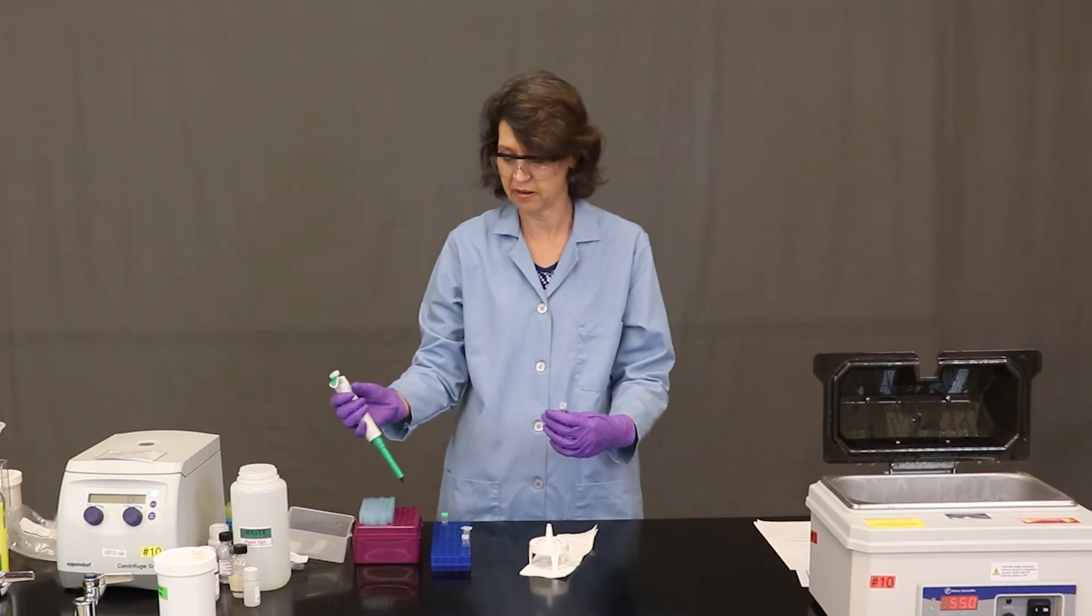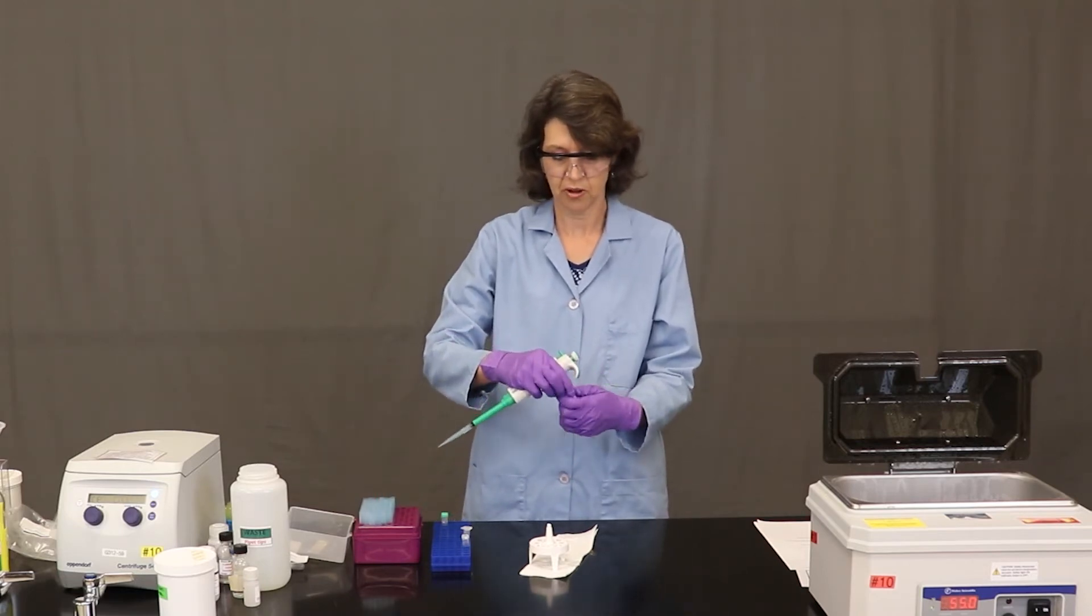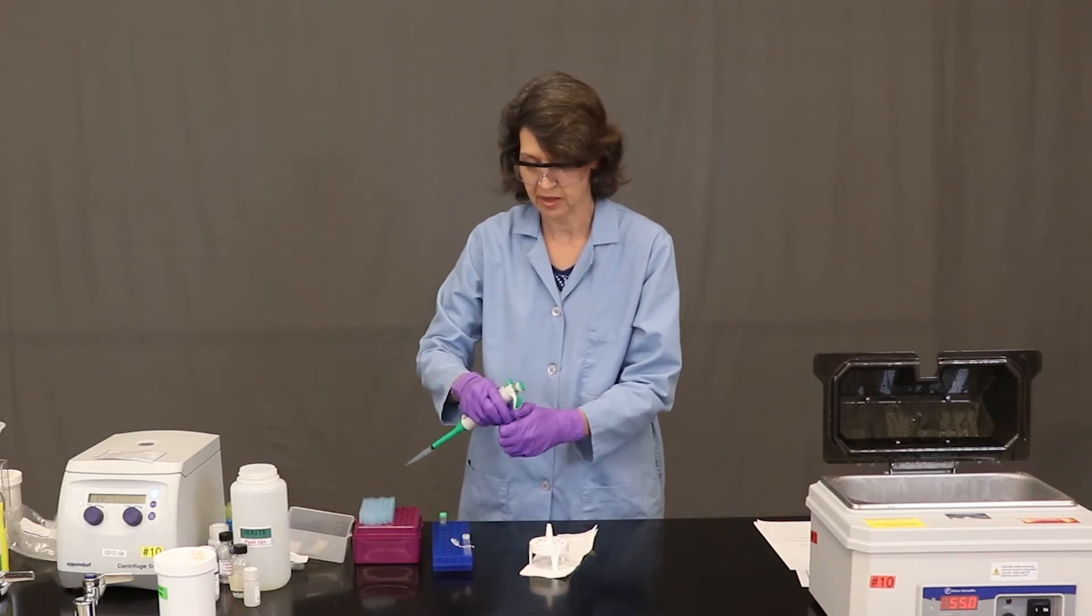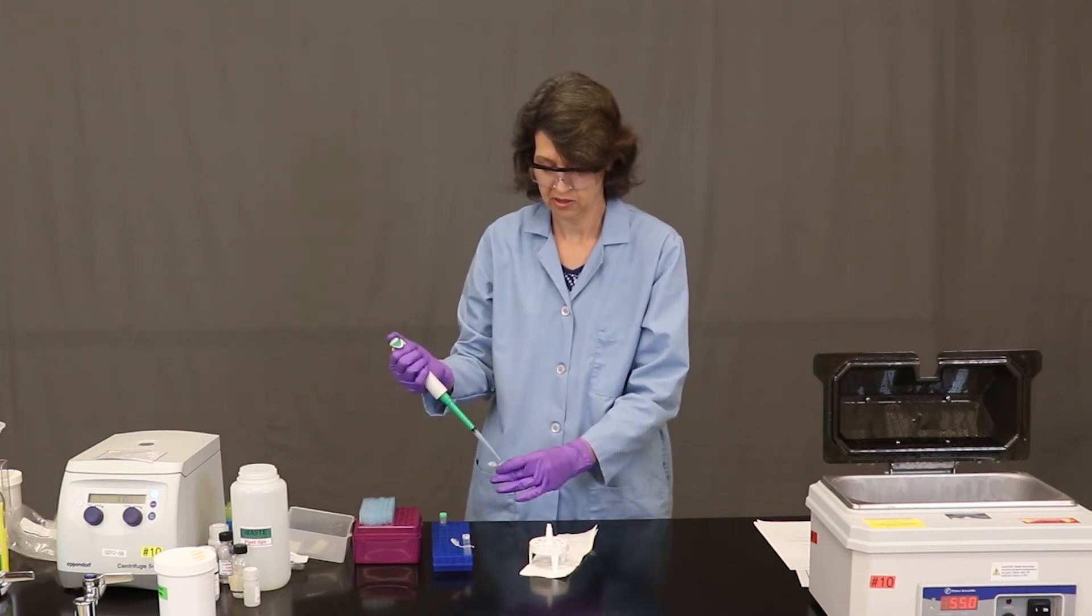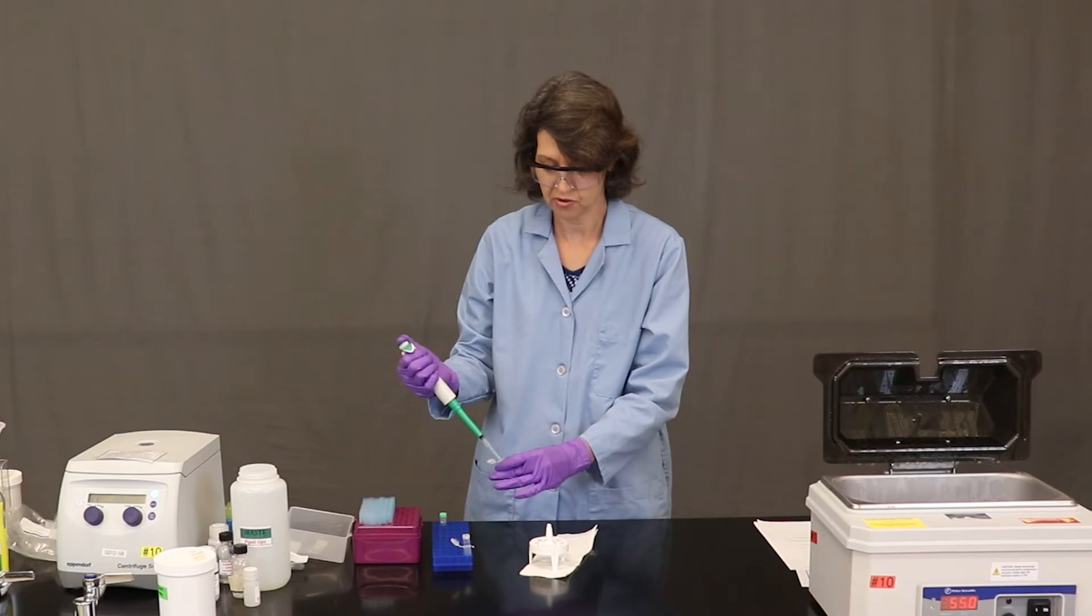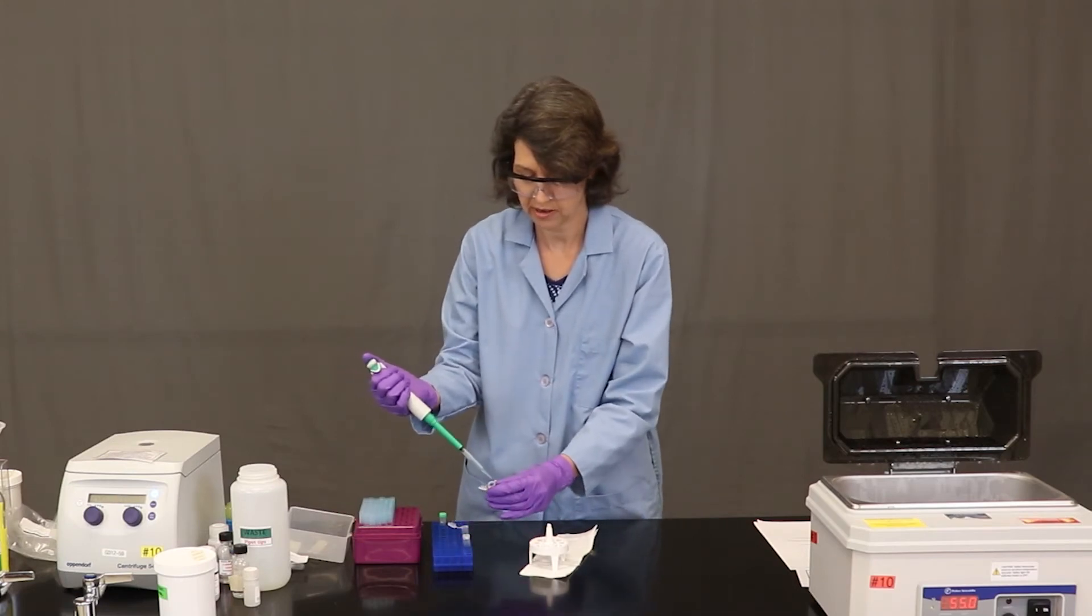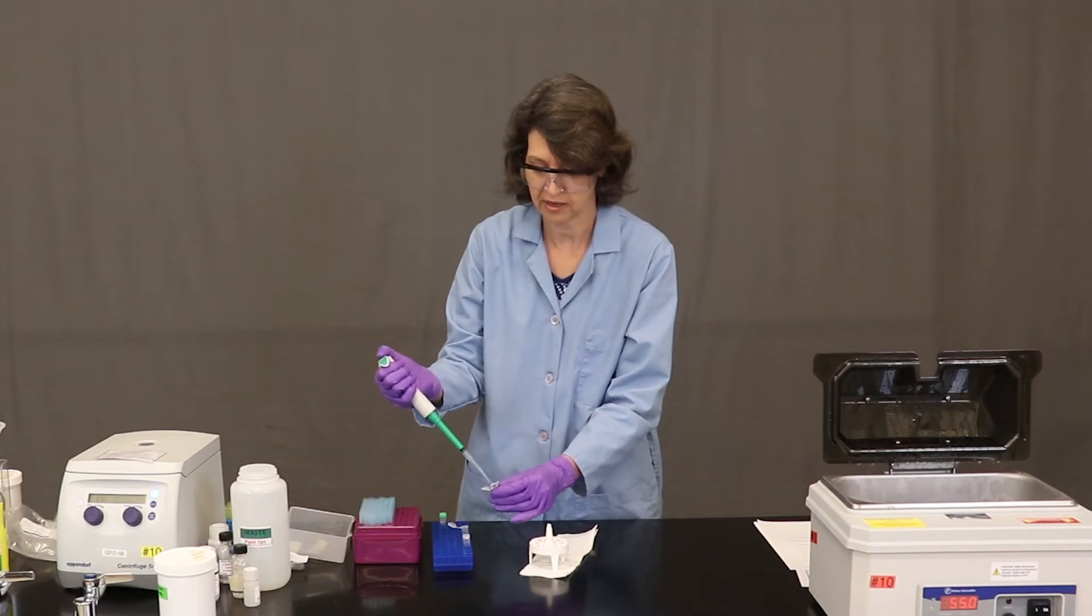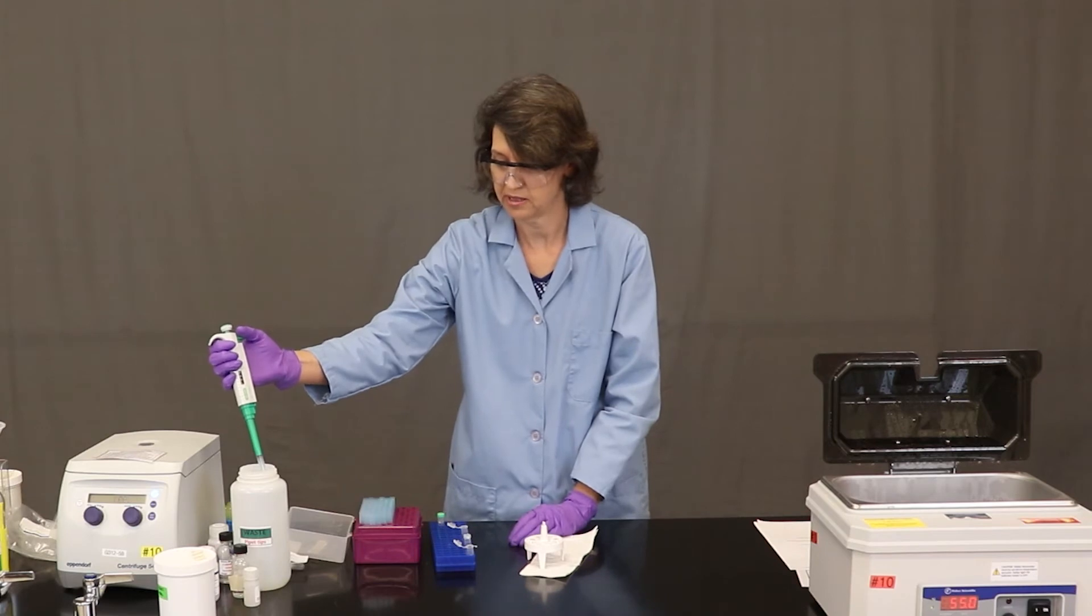So I'm adding a larger volume of solution this time. So I've got a larger micropipettor. This one is going to measure 200 microliters. And I've got larger tips. So I'm going to add first the 200 microliters of buffer. And so I'm pushing down to that first stop, drawing up the solution. And then I'm going to add it to my microfuge tube, push the last stop so I can get that last drop out.